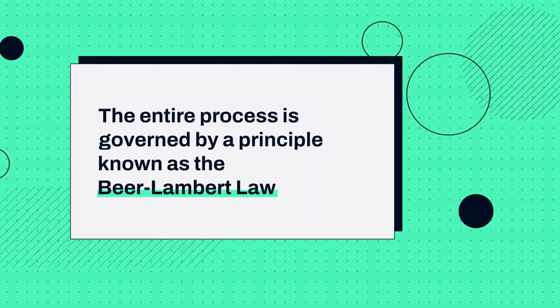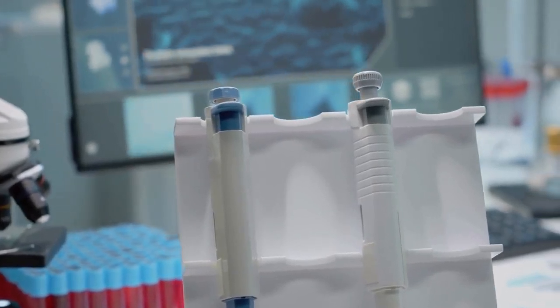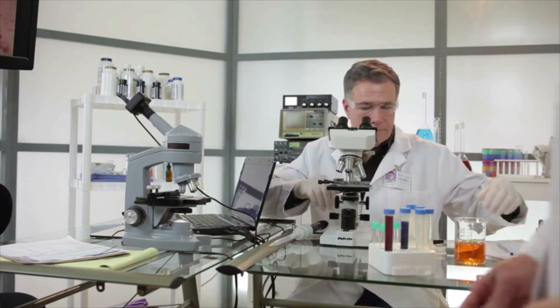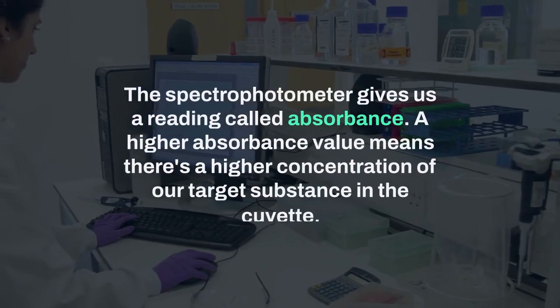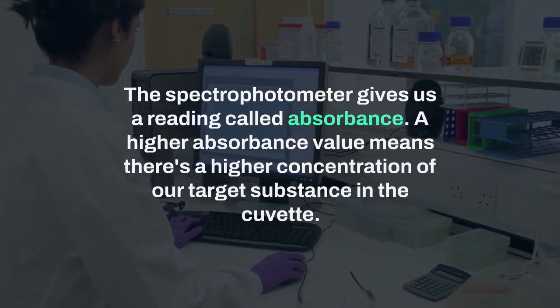The entire process is governed by a principle known as the Beer-Lambert Law. While the name sounds complex, the idea is straightforward: the amount of light a substance absorbs is directly related to its concentration. More substance means more light gets absorbed. The spectrophotometer gives us a reading called absorbance, and a higher absorbance value means there's a higher concentration of our target substance in the cuvette.